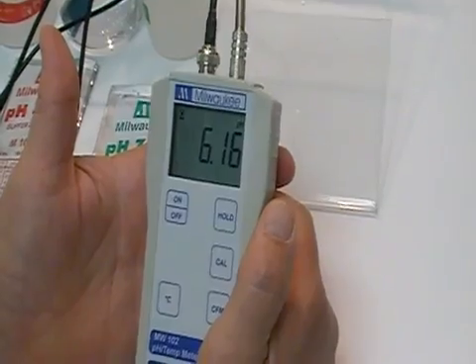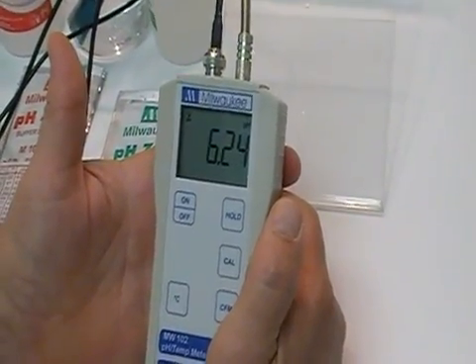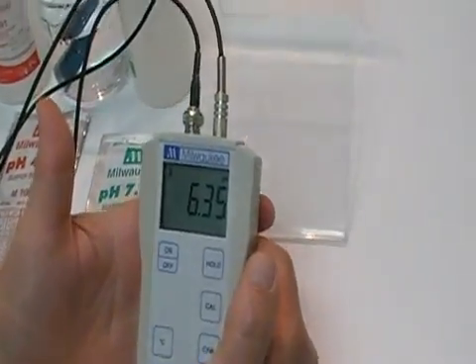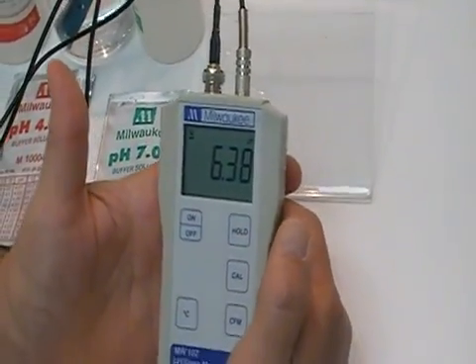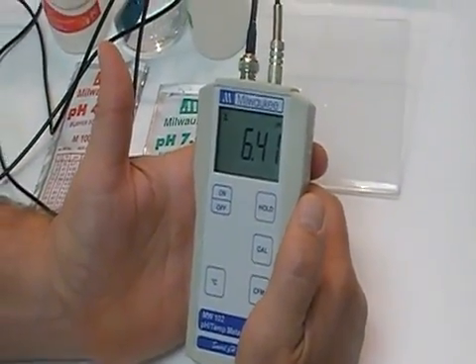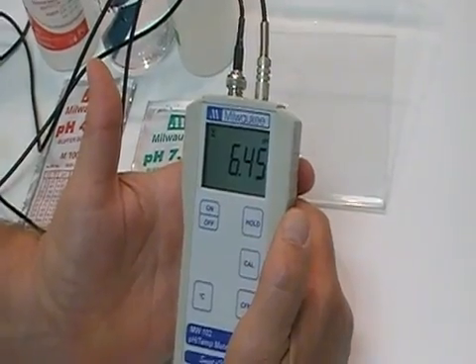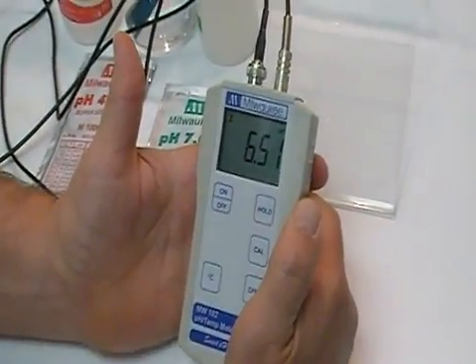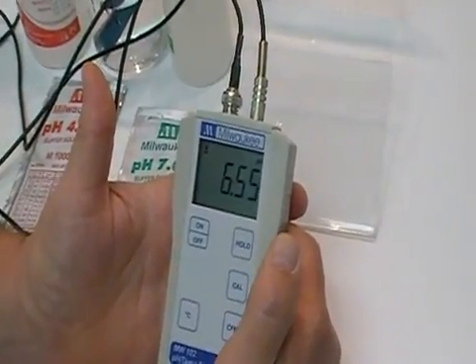That tap water is actually from our cooler, so it's pretty cold — that's the reason for the low pH. Always allow time for the values to settle in. It generally takes on a unit like this about 10 to 15 seconds to get stable.